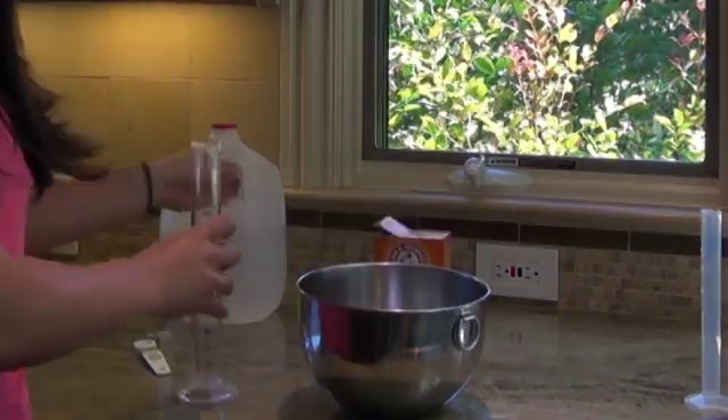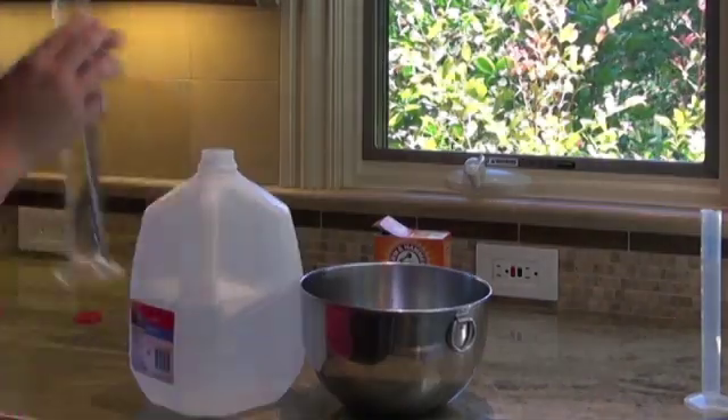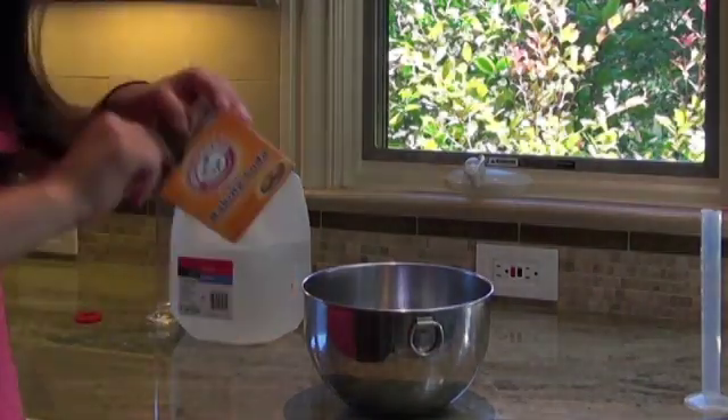Add 200 milliliters of bottled water measured using a graduated cylinder. Then add 2 grams, or about half a teaspoon, of sodium bicarbonate or baking soda. Mix everything together and you're ready to go.